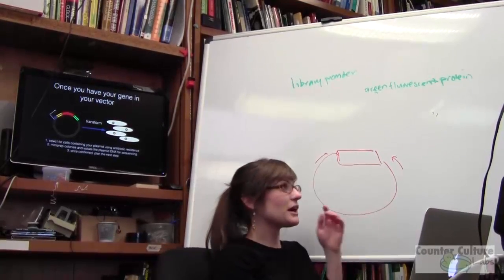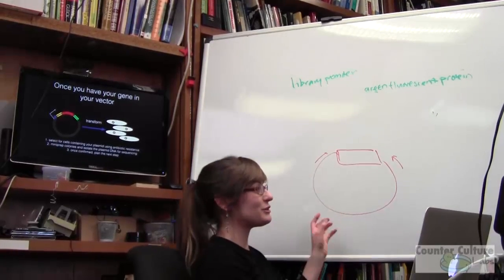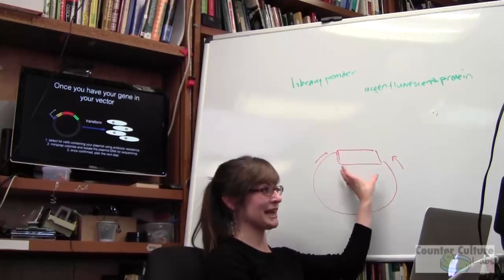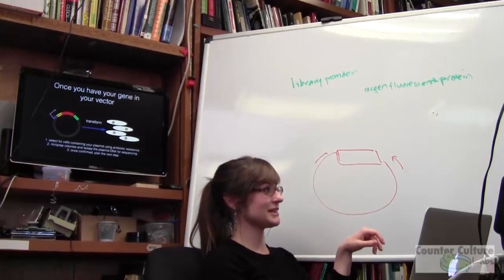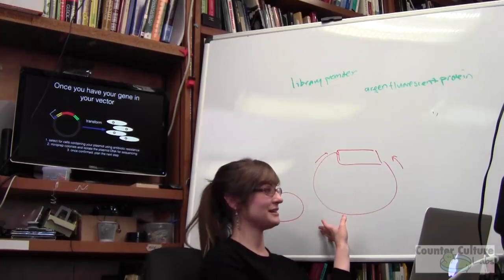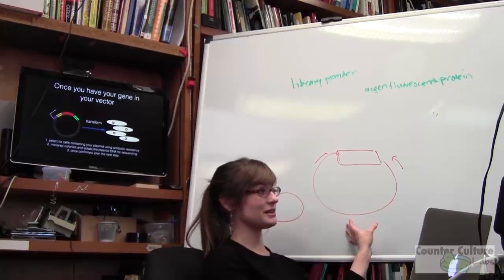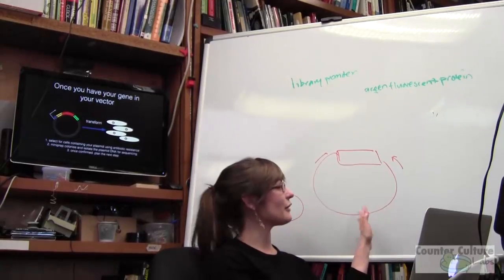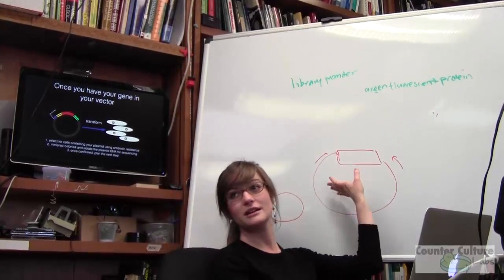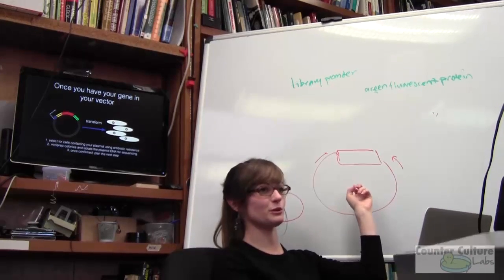Okay, so in your ligation reaction, is every vector going to be ligated? Do you think it's going to be one-to-one? Might you get some self-ligated? You shouldn't, but you might. Or maybe it'll just be background that never got digested, right? Things like that. So what would be the best way to tease all this apart? After you've ligated your piece of DNA into your vector, how do you isolate that one clone that worked to move forward with?